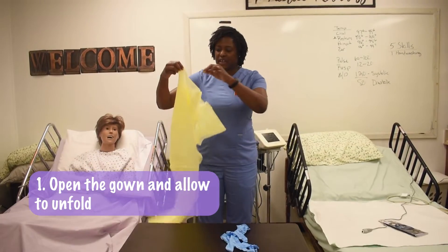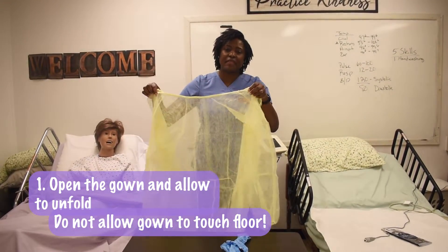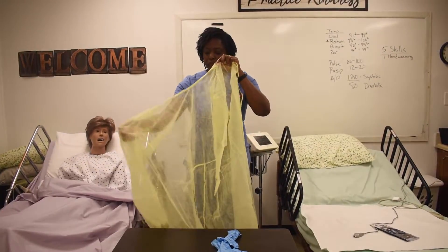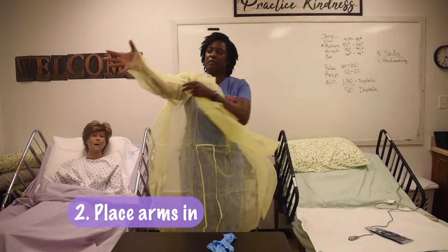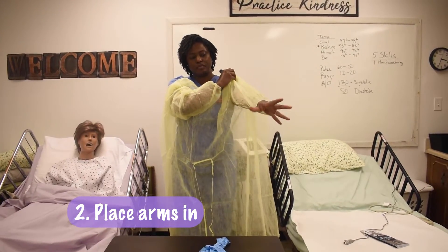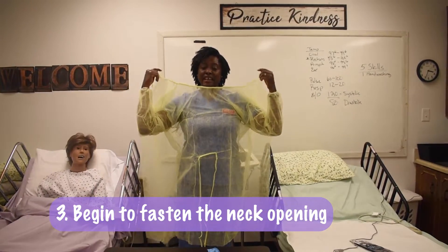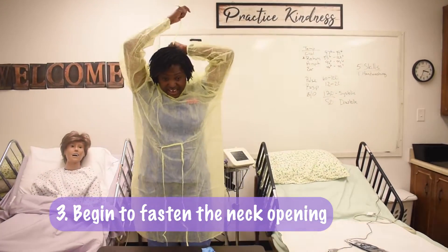We open the gown and allow it to unfold. However, do not allow the gown to touch the floor. We place our arms in. We begin fastening by tying the neck.